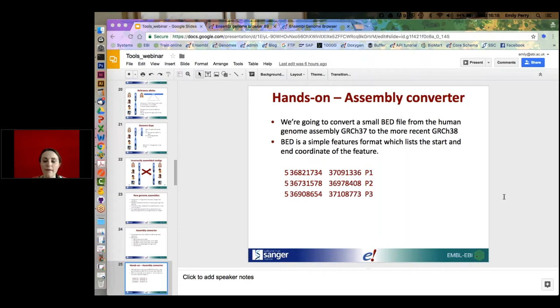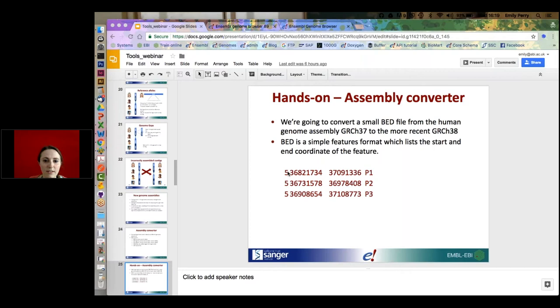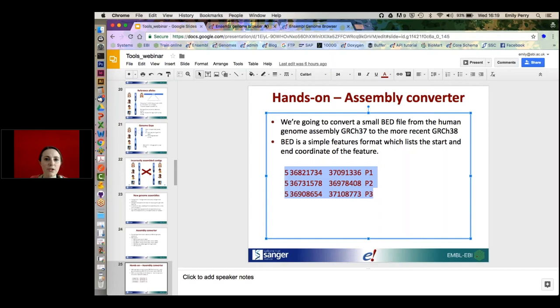Regarding a question about the HLA region — we have patches and haplotypes on the HLA region, so we would encourage people to call their SNPs and indels against the haplotypes covering the HLA region. I'm not really an expert on variant calling myself so I wouldn't know the exact parameters needed for your caller. Now let's go back to the Assembly Converter.